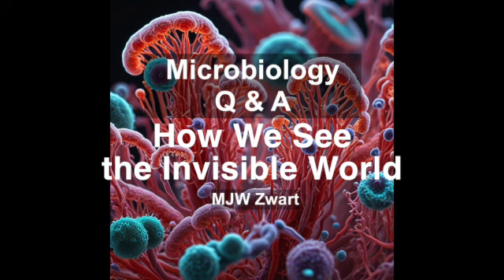Precisely. And there are several factors that affect resolution, including the wavelength of the light or electrons used and the numerical aperture of the lens. Okay, numerical aperture. That sounds a bit technical. It does, but it's not that complicated. Can you explain that in a way that even I can understand? Of course. Think of it like this. The numerical aperture of a lens describes how well it gathers light. Yes, it's a measure of its ability to capture light rays coming from the sample and focus them to create an image. So a higher numerical aperture means a better ability to gather light, leading to a sharper image. Exactly. And that's crucial for achieving high resolution.